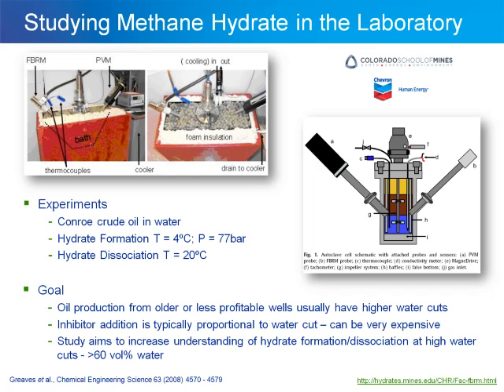The motivation behind this study was to understand the hydrate formation and dissociation mechanisms under higher water cut conditions, that is, greater than 60% water by volume, as is typically found in older or less profitable wells.